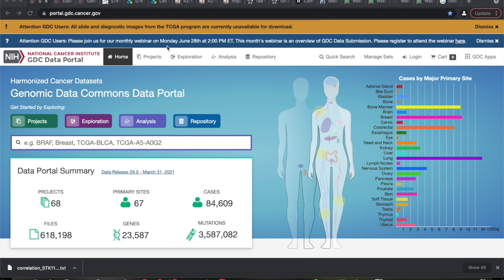Just Google 'the Cancer Genome Atlas' and your first page should look like this. Alright, we're going to go find some criminals — and not only criminals, but some gangs too. Lung cancer samples are definitely the most represented, so let's look at that.